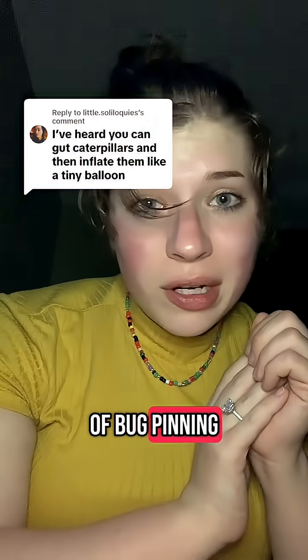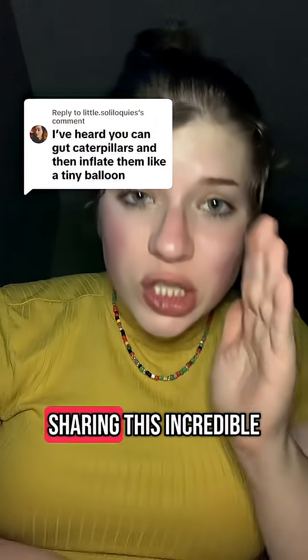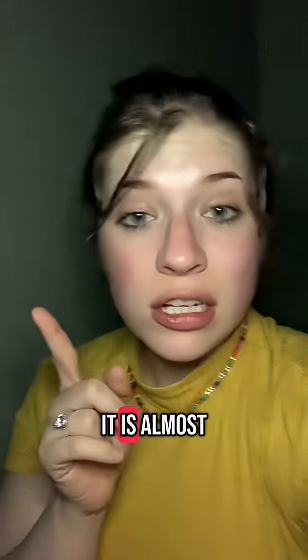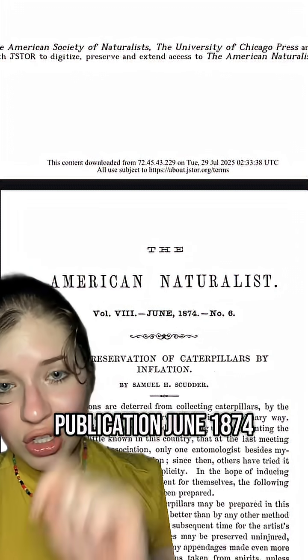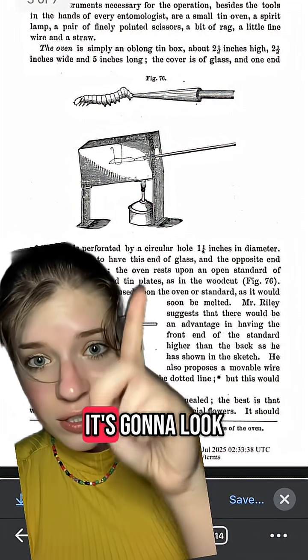Welcome to an incredibly special edition of bug pinning and preservation 101. A massive thank you to little soliloquies for sharing this incredible information. Caterpillar inflation is a very real preservation technique — it is almost a lost art. Here's the article I used to research the technique, dated June 1874, used by Victorian entomologists.